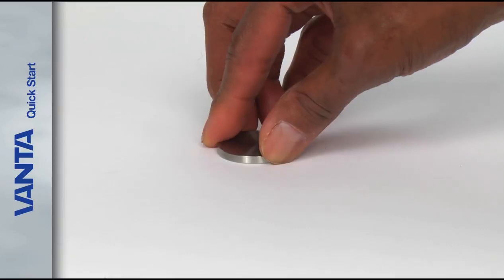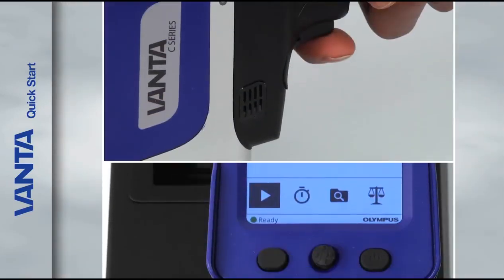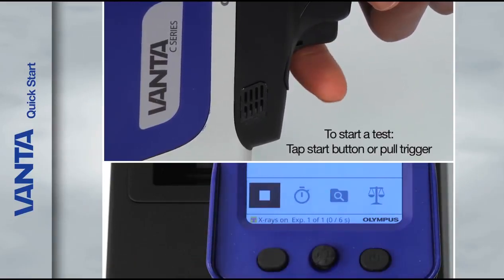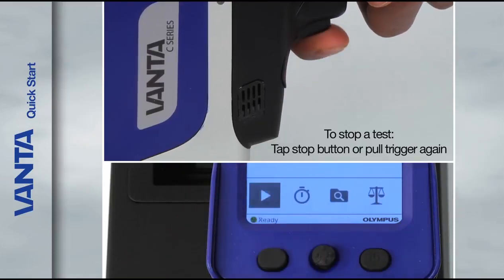When you're ready to perform a test, place your sample on a stable surface. To start a test, tap the start button on the screen or pull the trigger. To stop a test, tap the stop button or pull the trigger again.